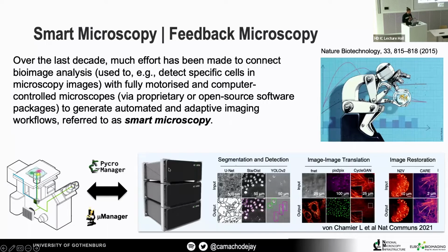So what we can do is take an image of the sample, then we can try to find a particular biological target, or we can even check if it's there or if we have to wait, right? And then the moment something interesting is happening, we might tell the microscope, okay, now please go and change your behavior, right? So the idea is that there is this sort of feedback loop built into the pipeline, and that would change what I would call automated microscopy to what I would call more smart microscopy.